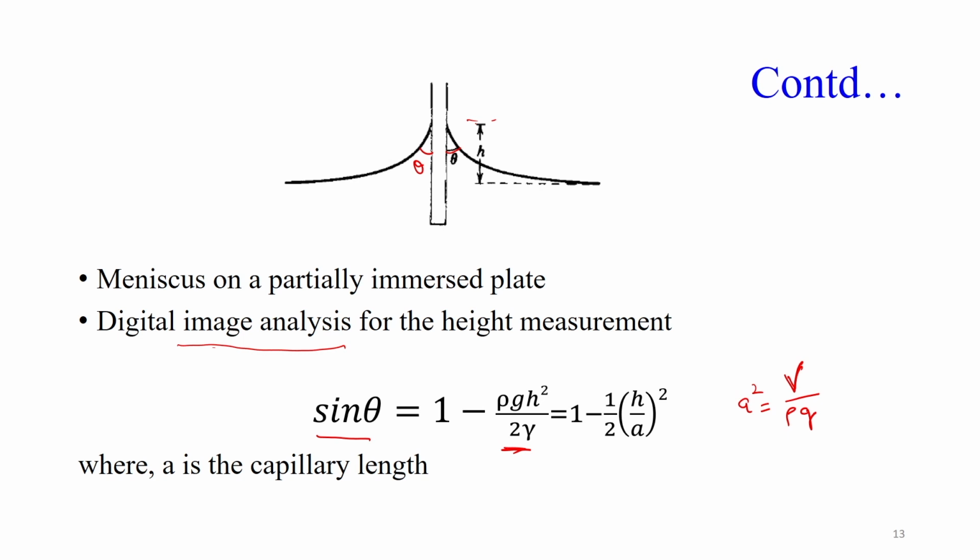We need not necessarily put a drop of liquid on the surface, but here the limitation is that we cannot play much with the material of the plate, because there are two constraints.